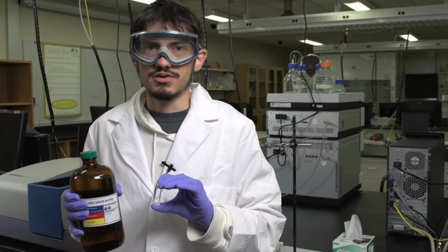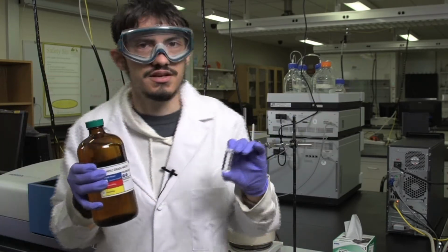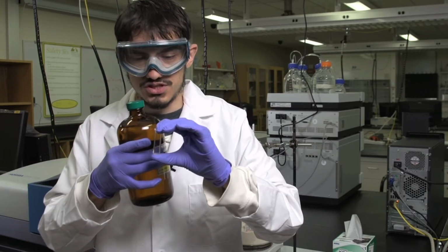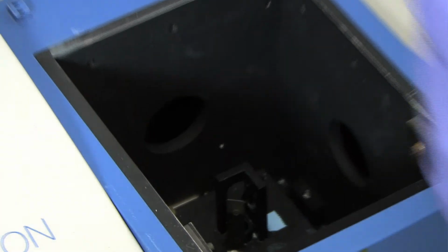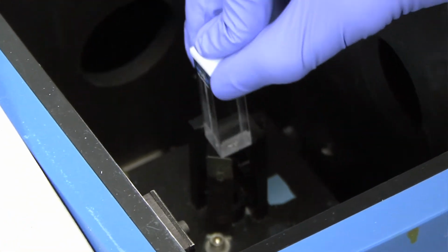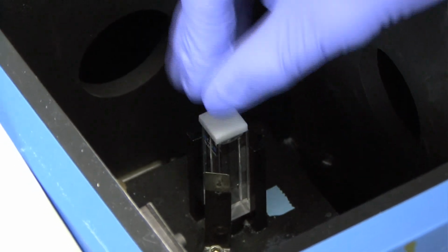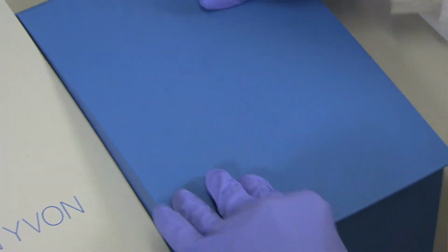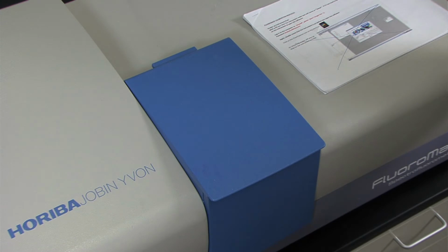To calibrate the fluorimeter, you will need to use HPLC grade water, which is available over near the sink in the lab, in a quartz cuvette, being sure to fill the quartz cuvette at least 3/4 of the way full. Remove the top to the sample chamber and carefully place the quartz cuvette with the HPLC grade water into the sample holder, making sure it's completely down and secure. Then replace the top and make sure it's secure so that light from the lab does not enter the sample chamber.